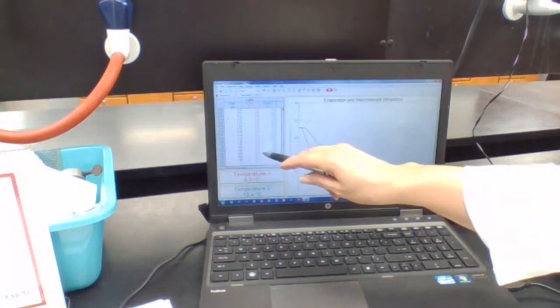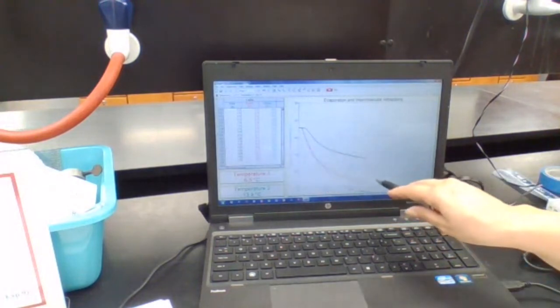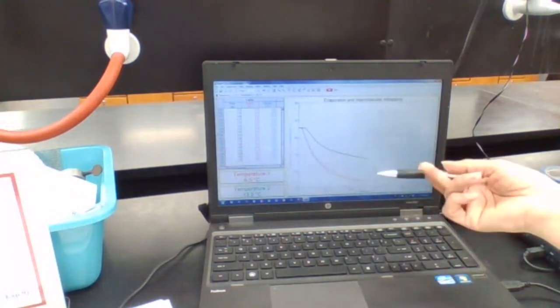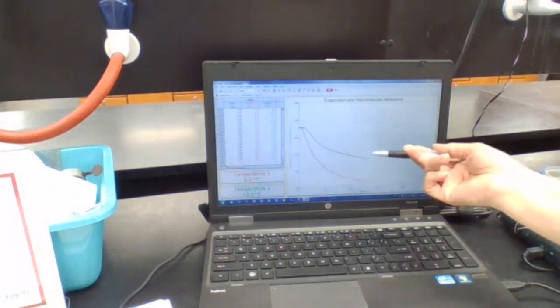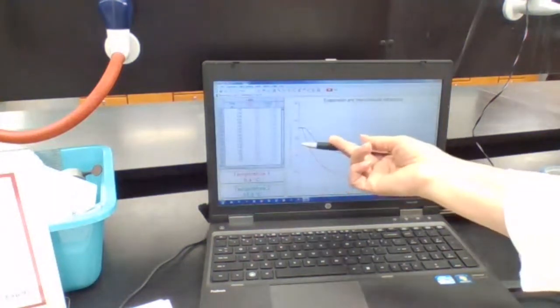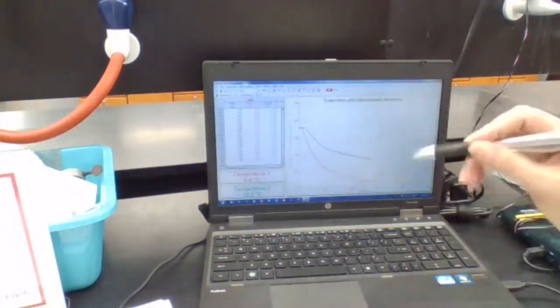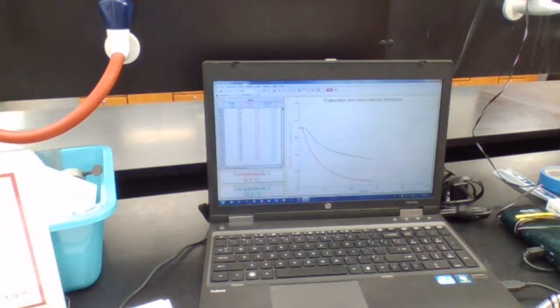When it does reach a plateau, when the temperature stays constant, I can stop it. I can see here now is like 6.5 for this one. The green one is 13.3. I can stop at this point. For methanol we start with 23 and it reached down to 6.3. Ethanol starts with 22.9 and it reached down to 13.1.